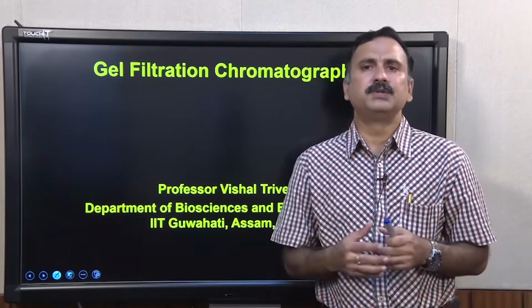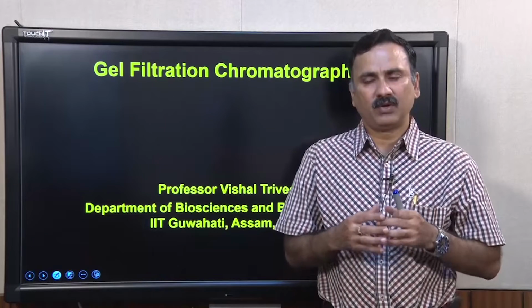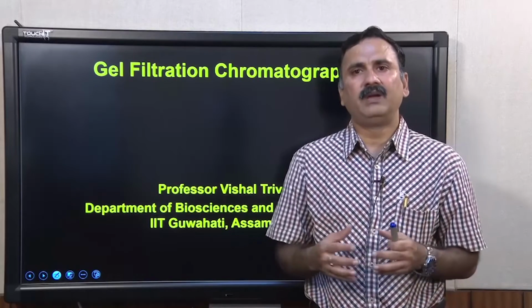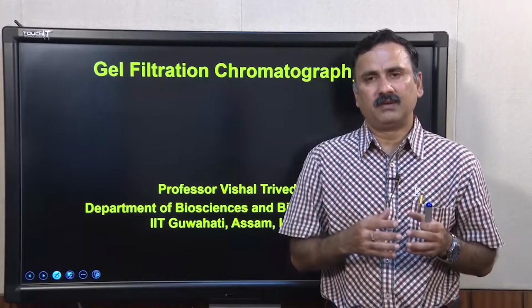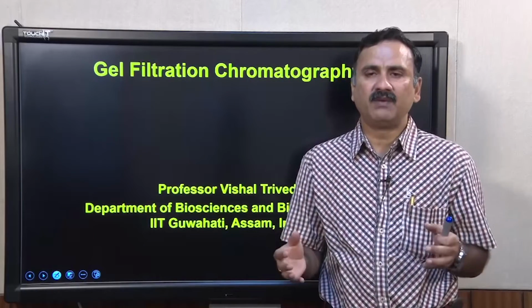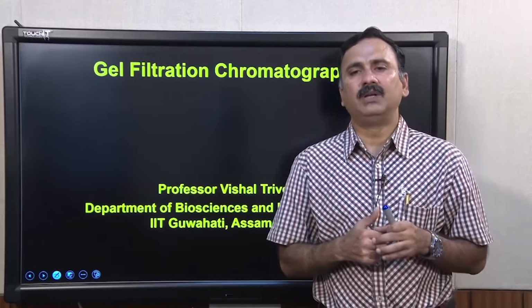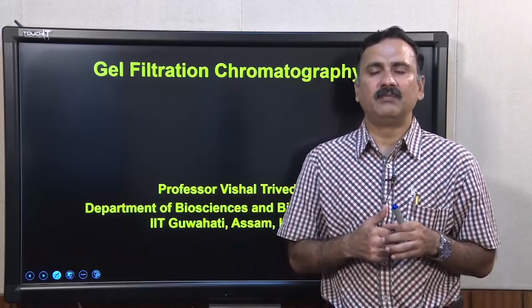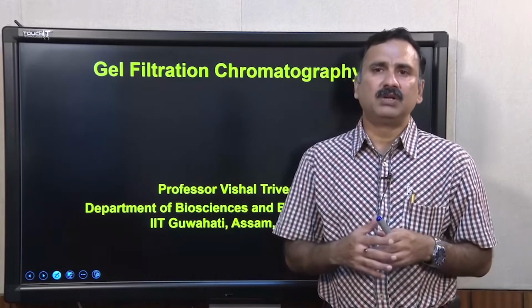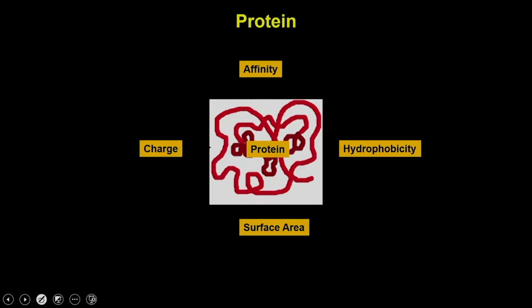In this course, so far we were discussing chromatography. In the beginning we discussed the basics of chromatography, and then we discussed protein purification systems and how to operate them. In the previous two lectures we discussed ion exchange chromatography followed by hydrophobic interaction chromatography. In today's lecture we are going to discuss gel filtration chromatography.